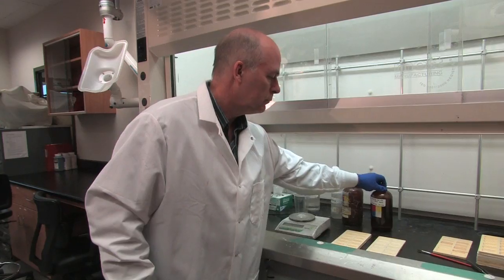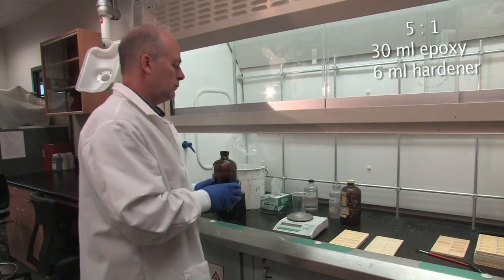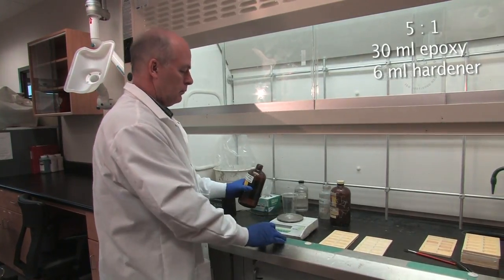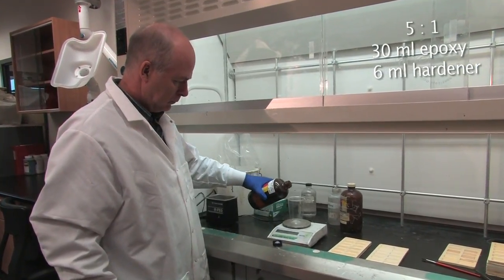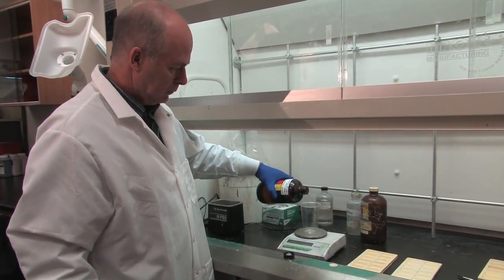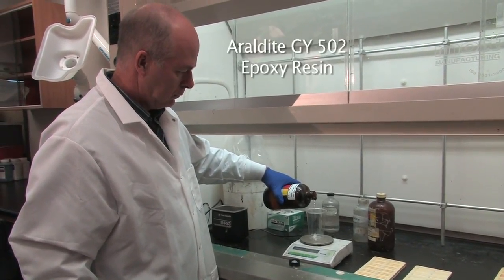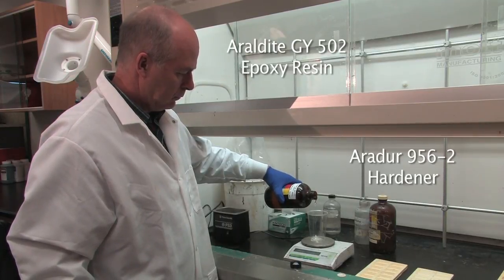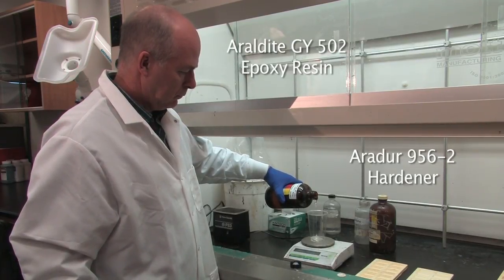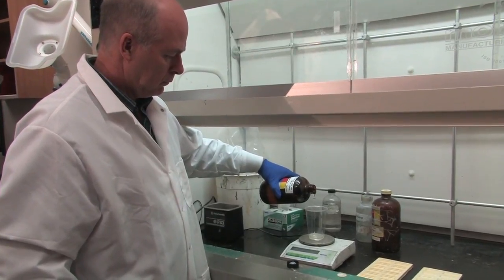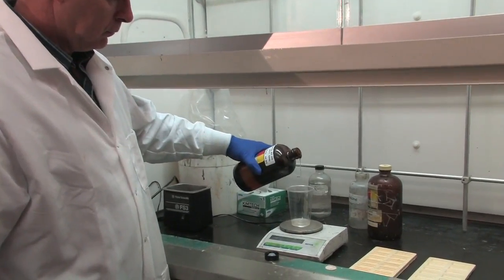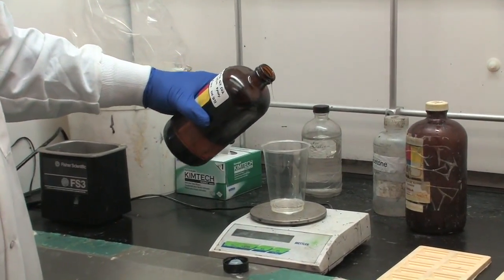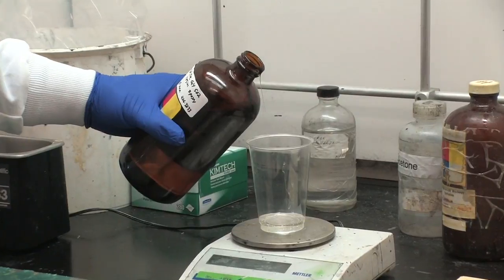The epoxy and hardener are mixed in a five to one mixture. Usually thirty milliliters of epoxy will be mixed to six milliliters of hardener and will fill a tray. For this embedding process we use a combination of Araldite GY502 epoxy resin and Aradur 956-2 hardener as it results in a clear hard mold. Any hard epoxy can be used but we use this particular one in our embedding. Be aware that the mixing ratio will change depending on the type of epoxy being used.